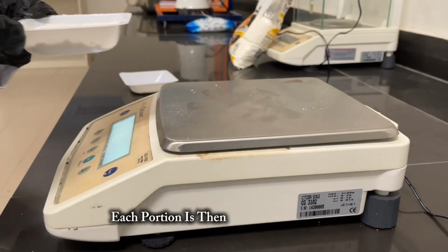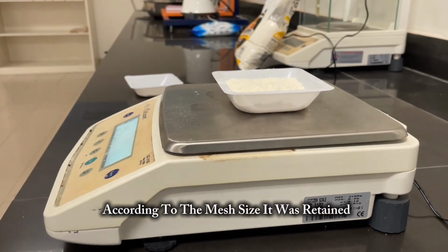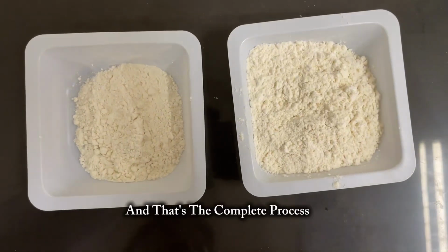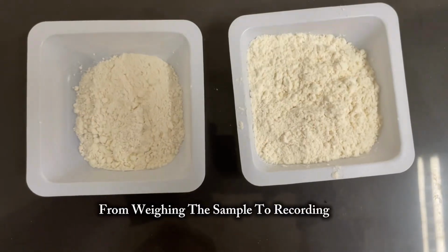Each portion is then weighed individually and the mass is recorded according to the mesh size it was retained on. And that's the complete process of operating a test sieve rack, from weighing the sample to recording the final results.